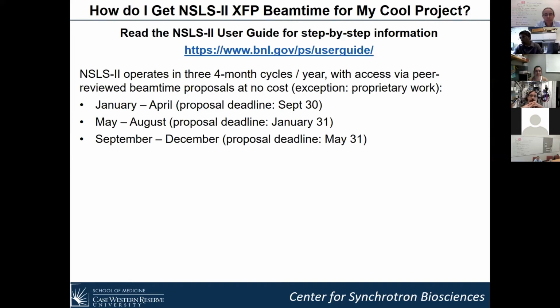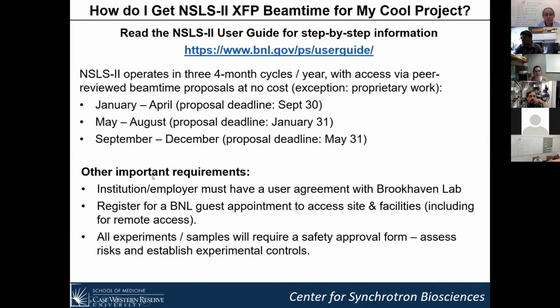All access is via peer-reviewed beam time proposals at no cost to you, with the exception of proprietary work. I show the cycles and the typical proposal deadline, which is about 3 to 4 months before the cycle in question. And just to reiterate, if you're planning pretty much any experiment, even if it's just remote, your institution should have a user agreement with Brookhaven Lab that governs your access to the user facilities. You need a guest appointment to access the site and facilities, and quite honestly this is true even for a purely remote access or mail-in experiment. You still should have it.